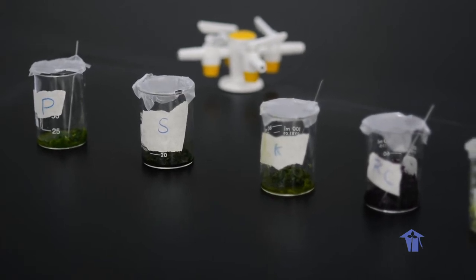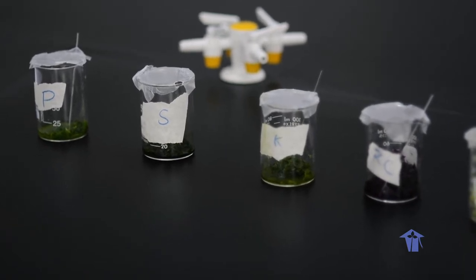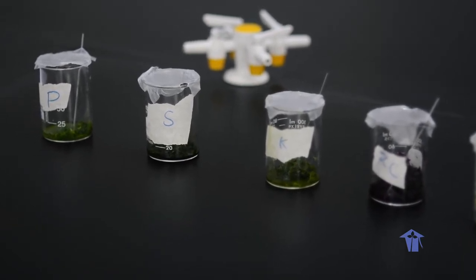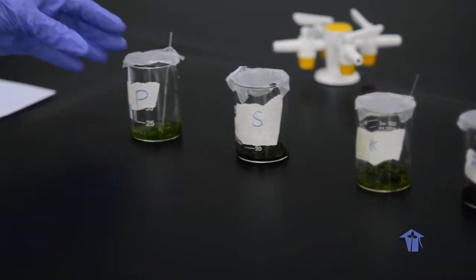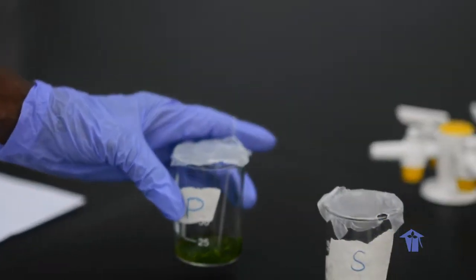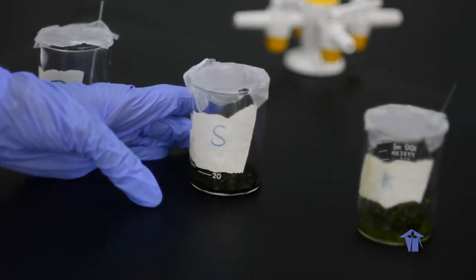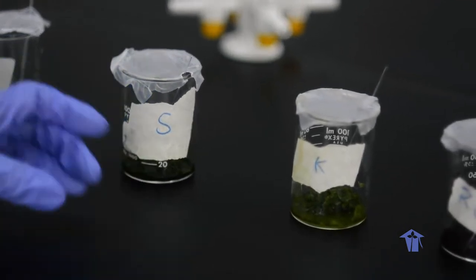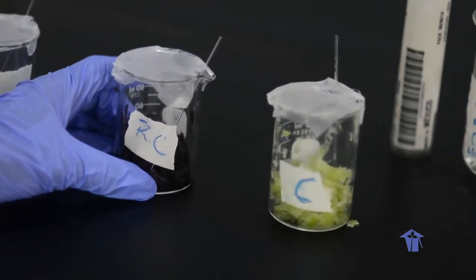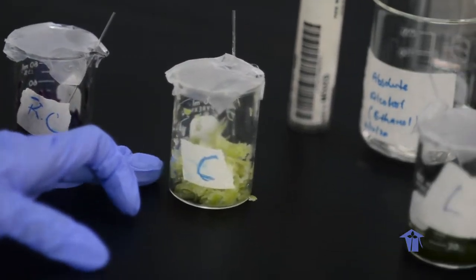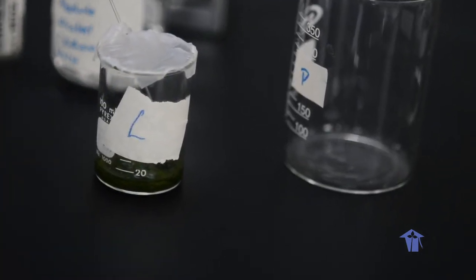We have here leaves taken from six different leafy vegetables and we want to compare the range of pigments that are found in these leaves. In our first container we have pak choy crushed, in the second one we have spinach crushed, this one we have kale, red cabbage, cabbage, and in the last one we have regular lettuce.